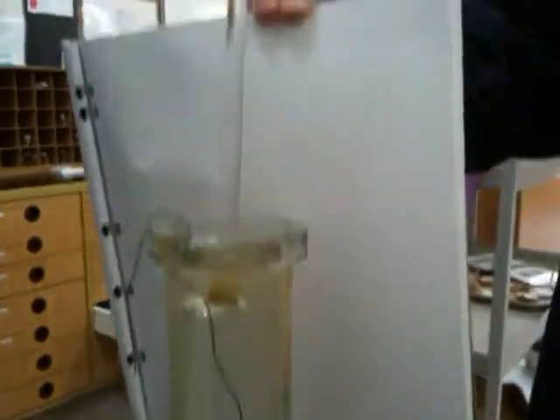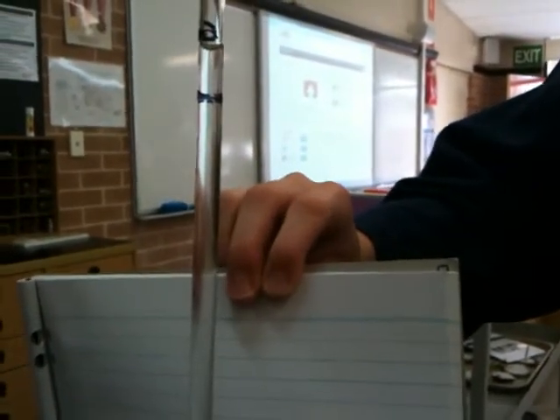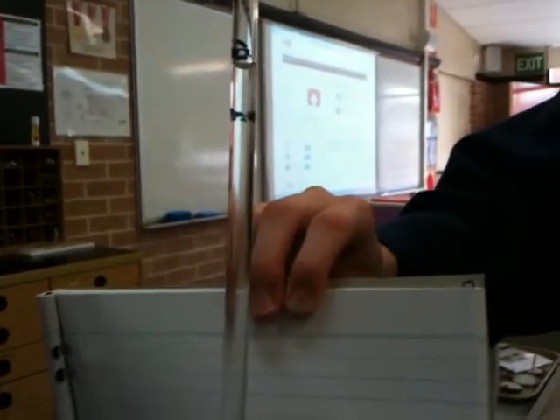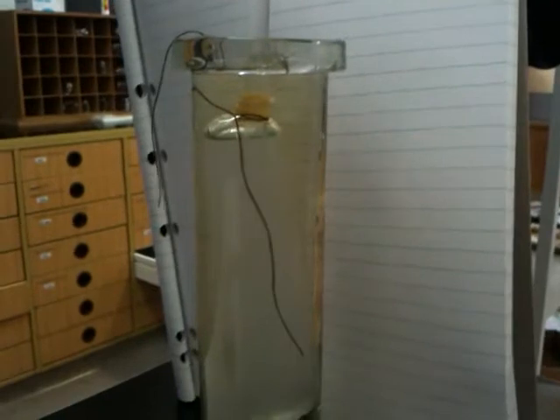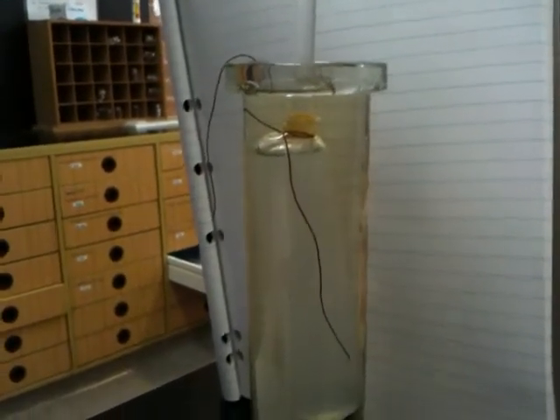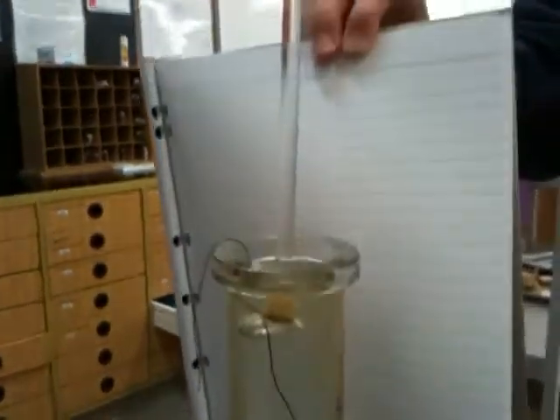Currently the starch and water is at the top line there. What would be the concern if that line went up, if we made a mistake? It would indicate that water is going through the semi-permeable membrane, and not just the iodine. Would that be bad? Yes, because it's only supposed to selectively let things in. Good, great. Let's have a look in a sec at what happened.